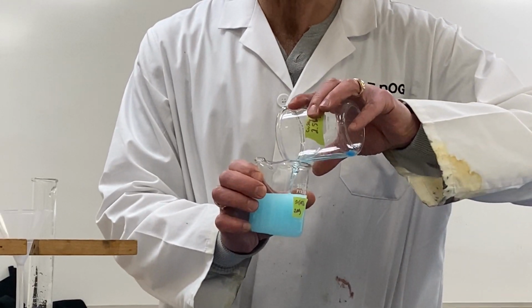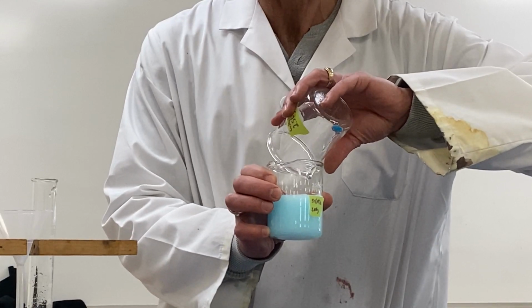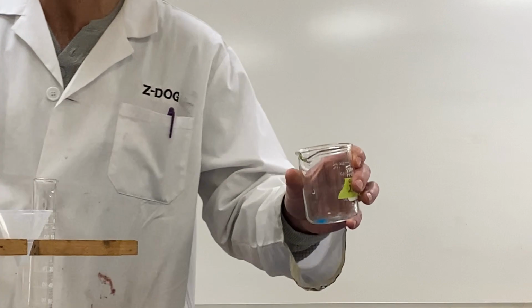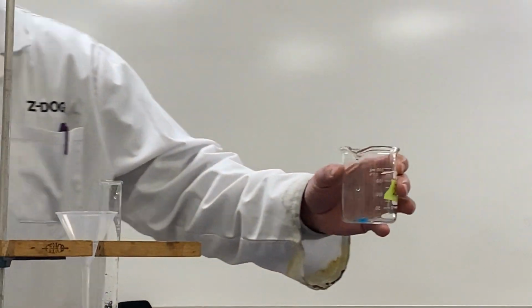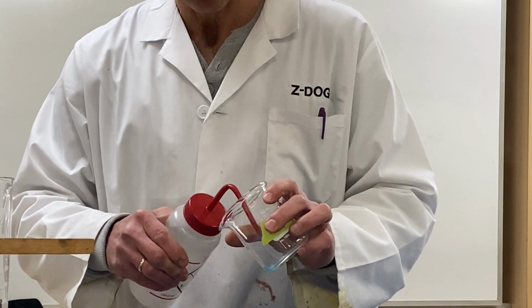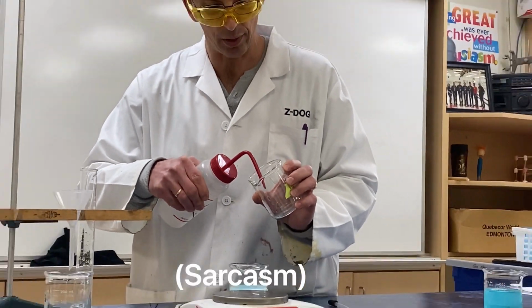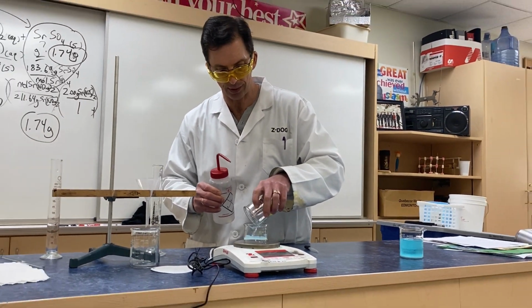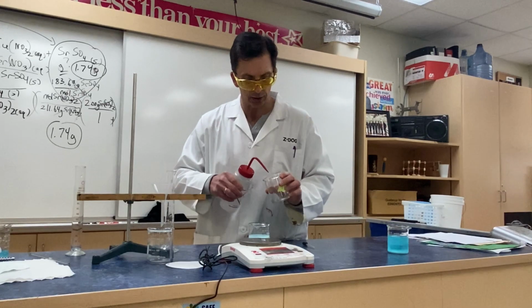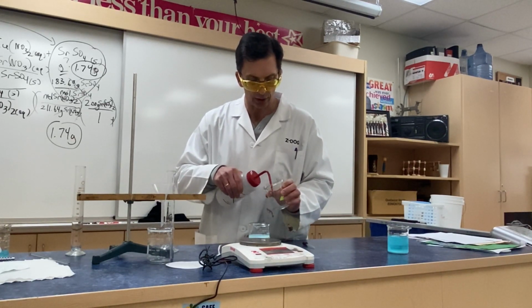And as you can see, the mixture becomes opaque. We have a cloudy solution. Very important to get every little portion of a mole out of our reaction container. I've actually zoomed in on that little bit that didn't go. Great camera action there. So rinsing. We want to get a complete reaction. We don't want any excess reagent left over.